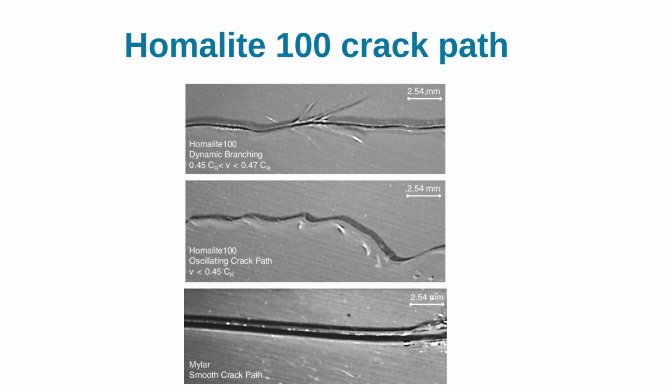Different characteristic zones exist. At crack initiation, conical markings can be observed. They result from the interaction between a macro crack front and micro crack fronts that develop downstream of the main crack. The analysis of these marks in terms of density and size makes it possible to estimate the crack velocity.